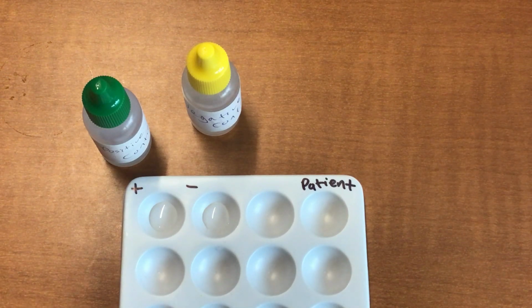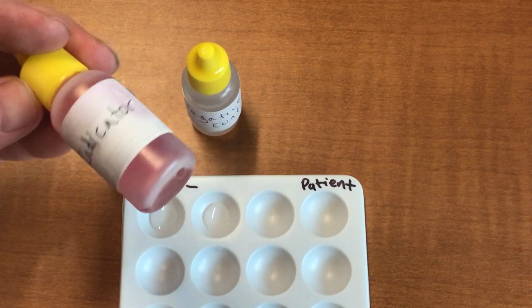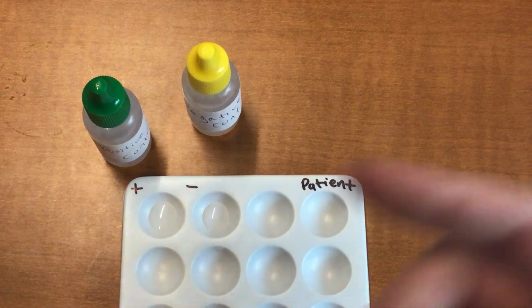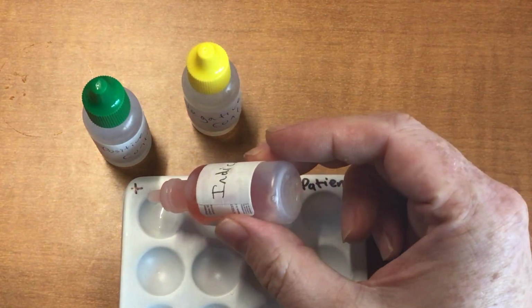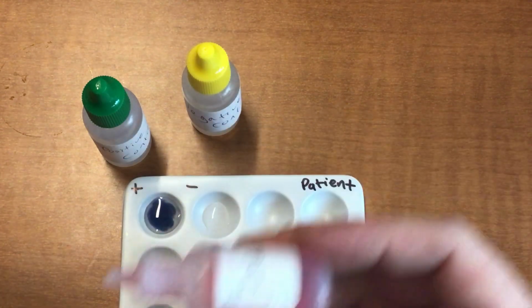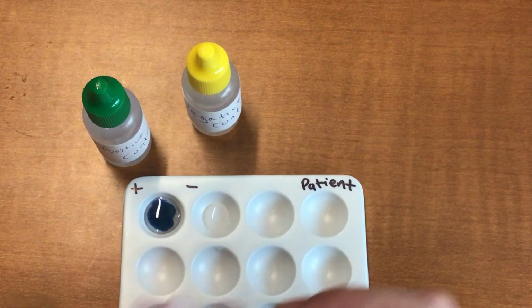And then what you're going to do is get this chemical indicator. Different chemical indicators react with different types of diseases, different types of substances. This indicator is going to turn different colors when it comes in contact with different bacteria, different viruses. So when I pour this indicator into the salmonella, the chemical and the indicator will turn a bluish color, showing that yes, that particular chemical composition that makes up the salmonella is present.